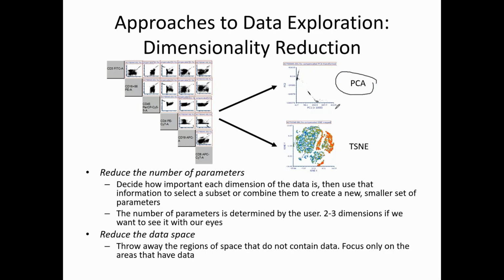And the idea is that PCA creates 2 new parameters, or as many new ones as you want, but usually people deal with the first 2 principal components. PCA stands for Principal Component Analysis. So here there's a plot of the 2 principal components.